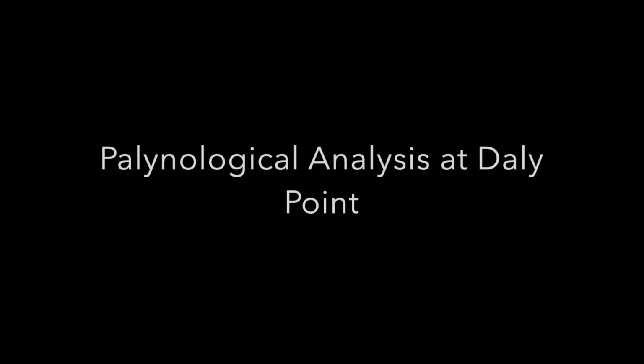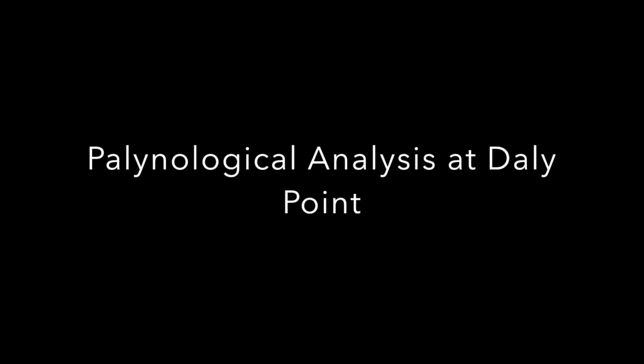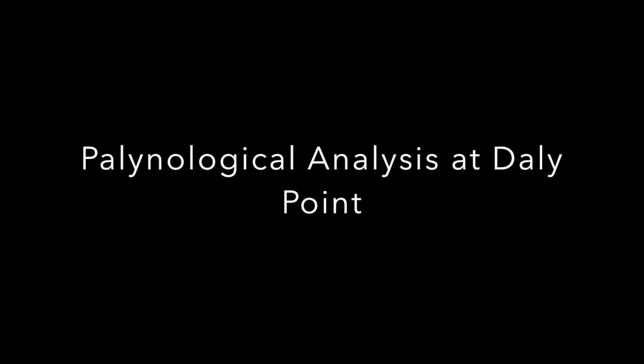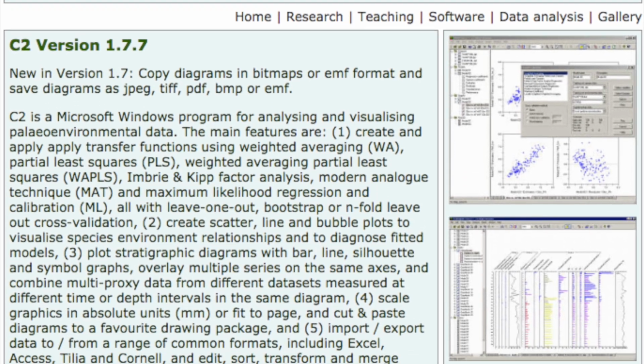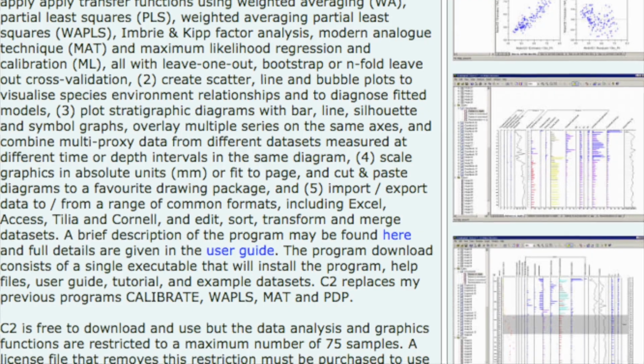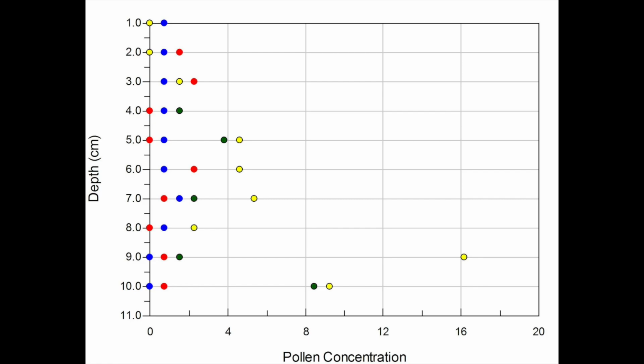A palynological analysis revealed several different possible things about this tree and the surrounding environment's history. It appears that our sample is only about 100 years old. I began the analysis with a program called C2 to generate pollen stratigraphy graphs for pollen percentages and a scatter point graph for pollen concentrations.